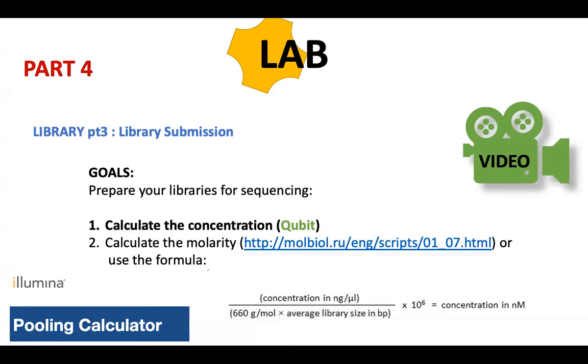Okay. So we've talked about the Qubit. So we use the Qubit to calculate the concentration. I just want to stress one thing. It's also possible to use the qPCR method to check the concentration of your final library, okay? These are just 2 different methods. If you have 96 libraries whose concentration you want to measure, the qPCR is going to be faster.